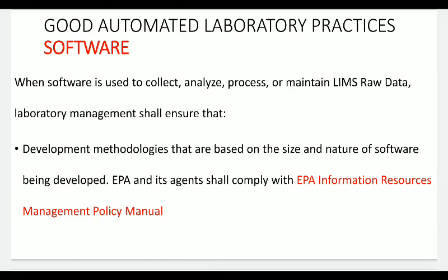Now, what is LIMS raw data? These data are completely unprocessed and they are directly fed into LIMS just after completing the experiment. So no further processing of the data has been done. This is called LIMS raw data.